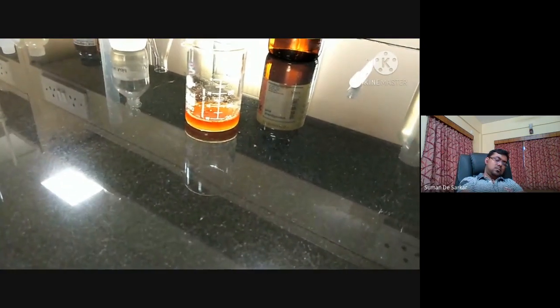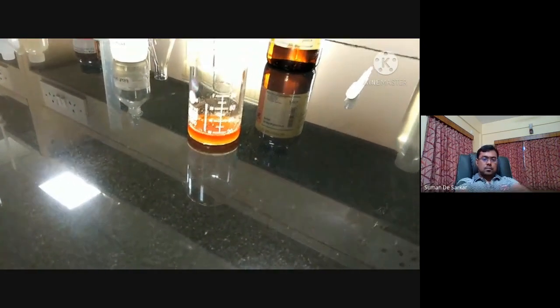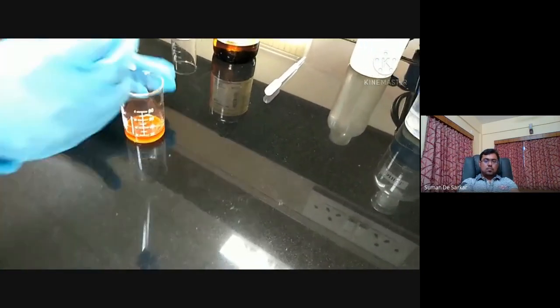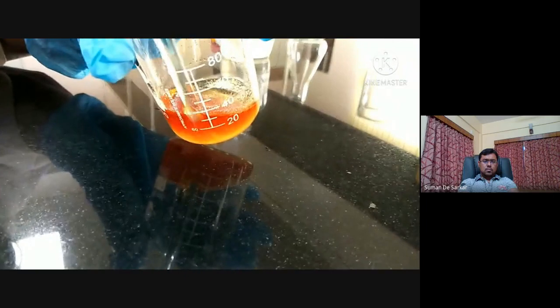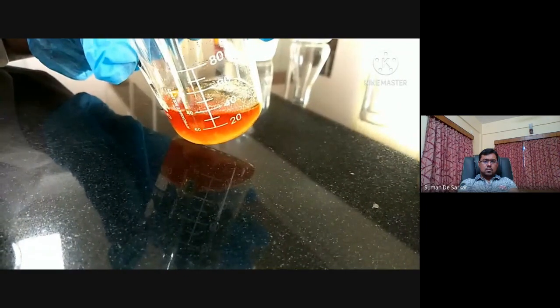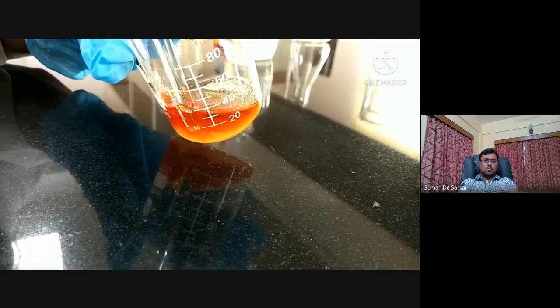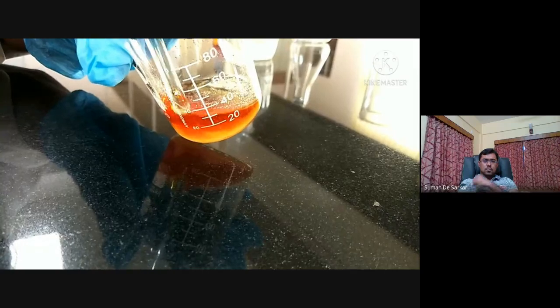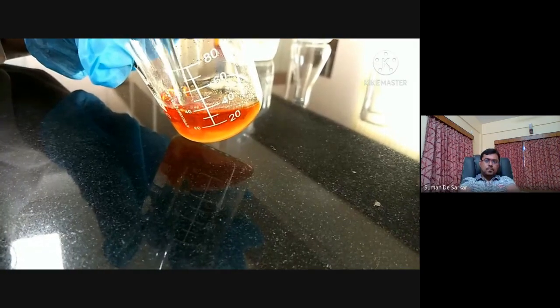After 1 hour of heating, we cooled it down, and you can see the volume has reduced a bit so that the precipitate can come. And I'll ask Nidhi to promote the precipitation, the crystallization, by scratching. Yes, see here, sometimes this mechanical energy is useful to get nice crystals or to promote the precipitation.